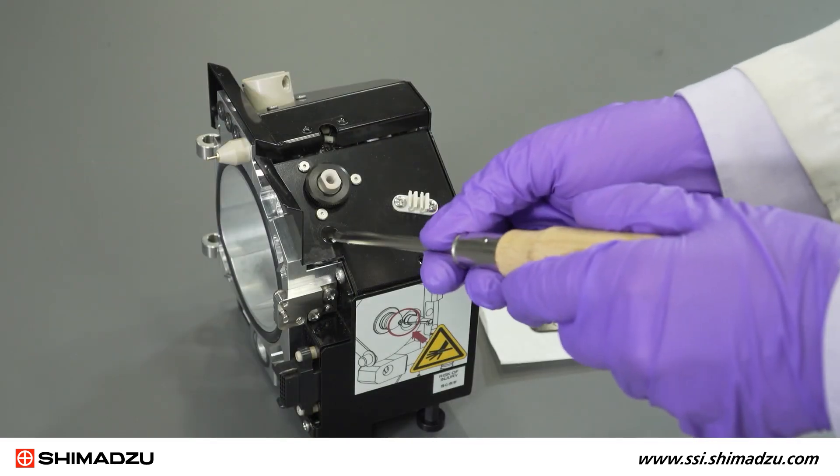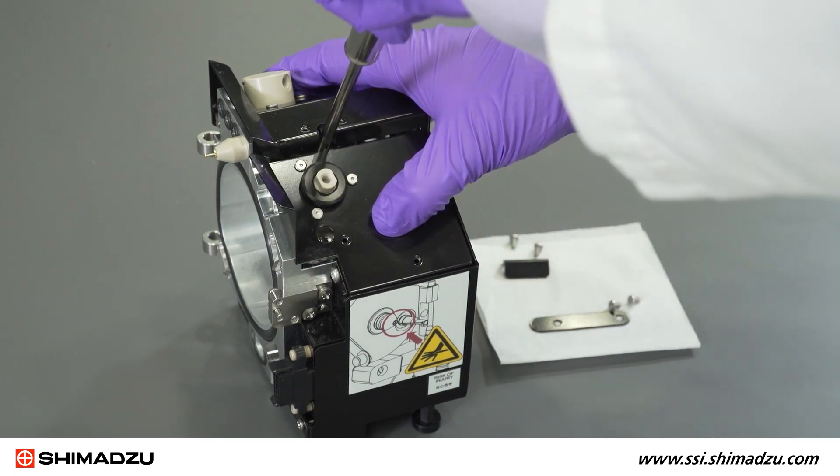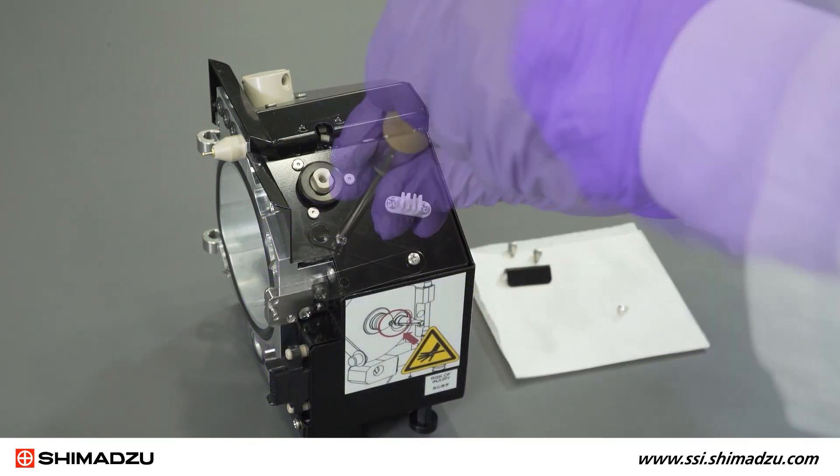After ensuring that the spray unit is held against the rear side of the ionization interface, tighten the two screws.